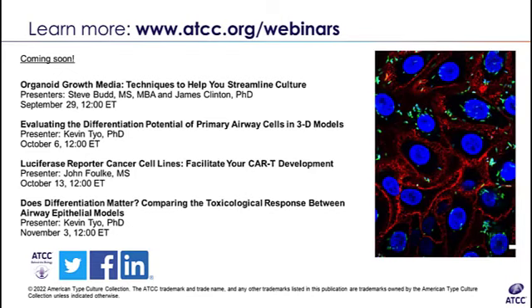All right, here's an interesting question. Can reduction of CO2 for a limited time induce change in the cell's shape and behavior? And I don't know if they mean limited time, like you pull your flask out of the incubator, put it in the biosafety cabinet, refeed the cells or do something like that, and then put it back in.